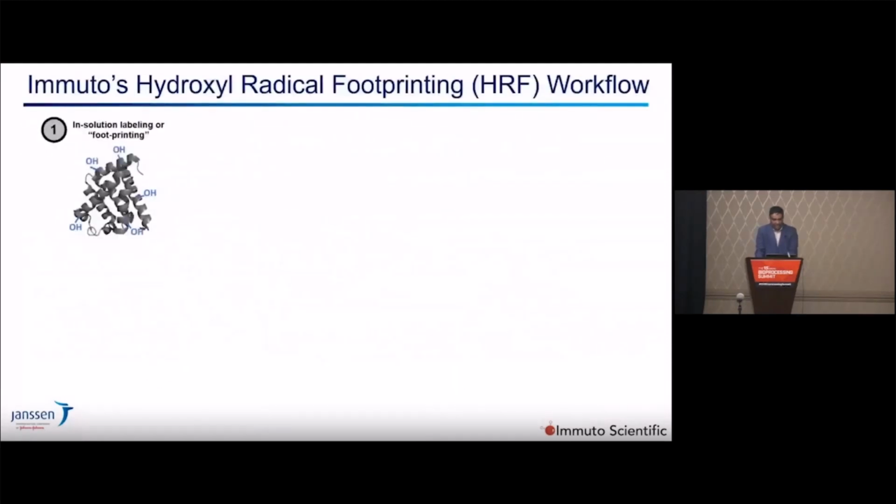So the technique starts with a native protein in solution, and we are labeling the protein in its native state and capturing the conformation through these labels. These labels are irreversible, and therefore what takes place subsequently to this labeling does not perturb or disrupt the information that was captured in the labeling itself.